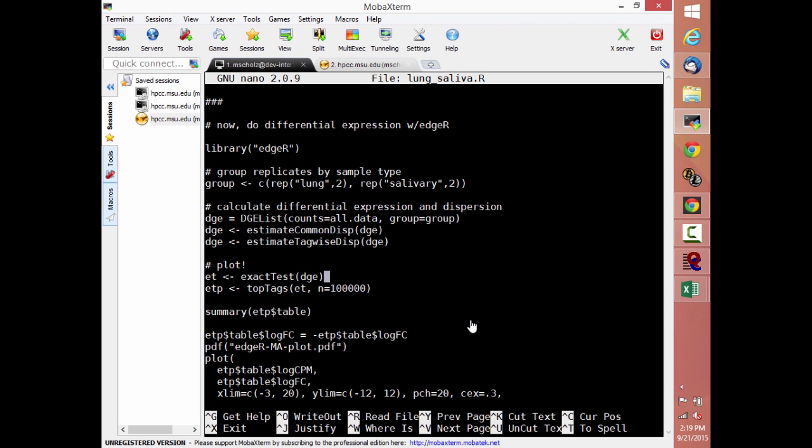Okay, so what is EdgeR never taking into consideration? What other confounding factors can you have in RNA-seq that we're not thinking about yet? What we don't know about these samples, because of the way that I grabbed this, is whether these samples are actually independent of each other.